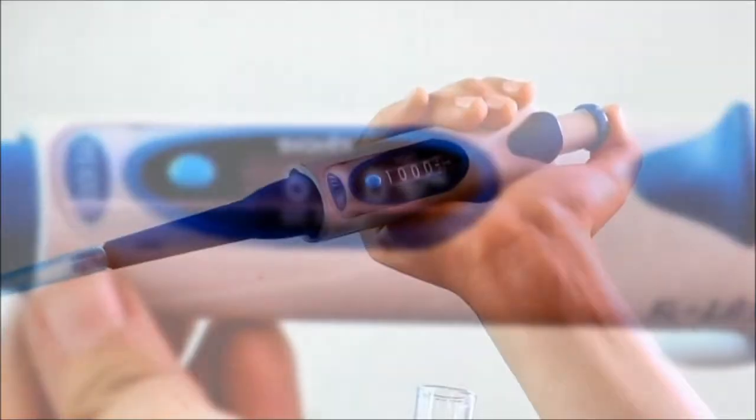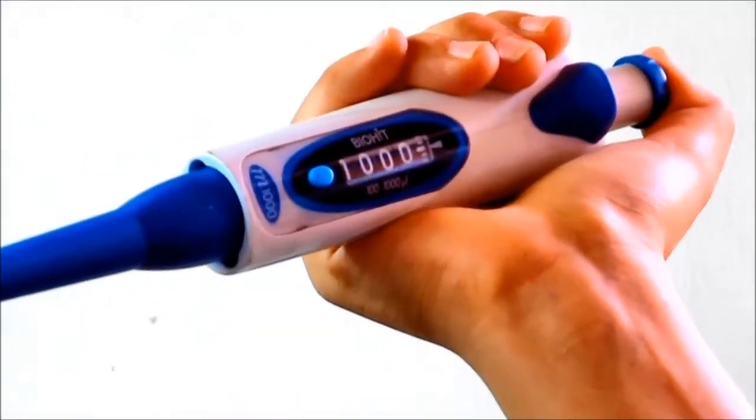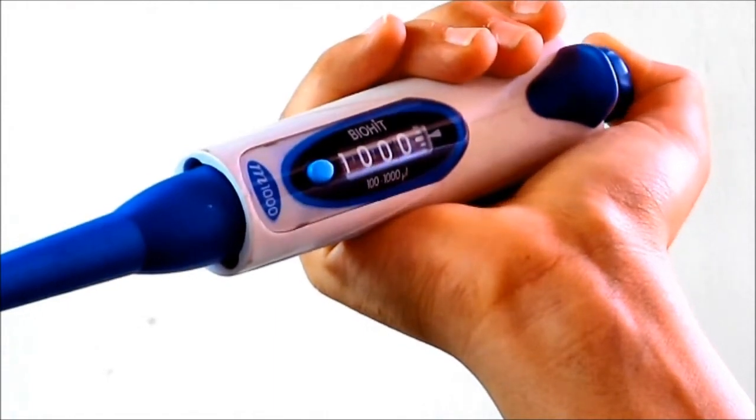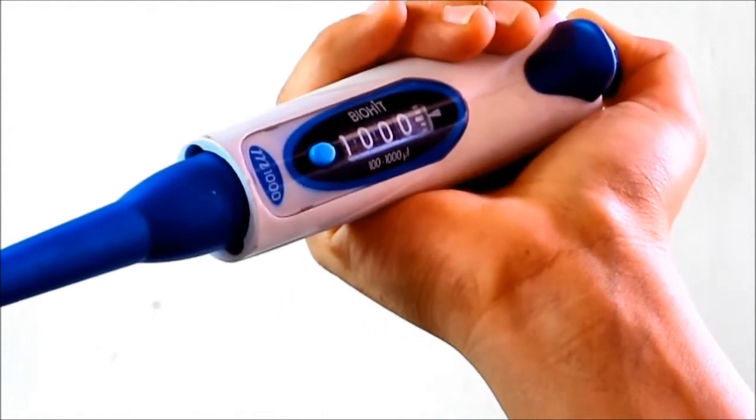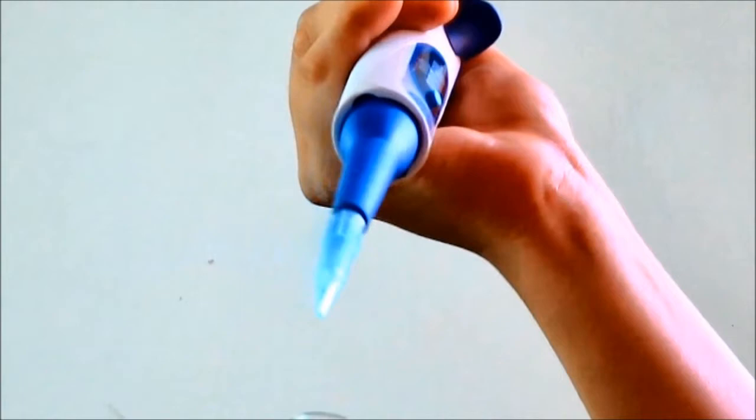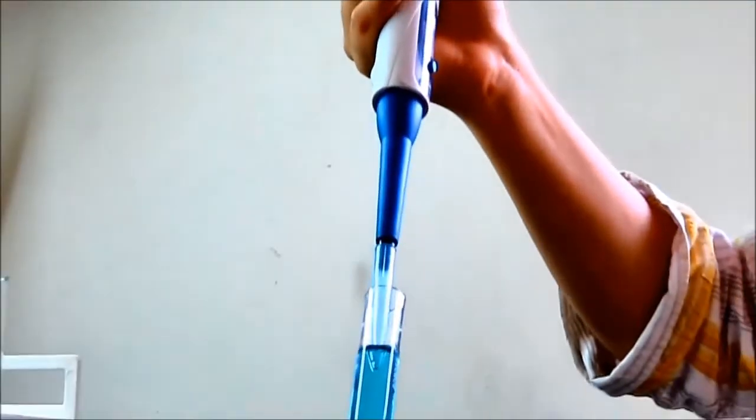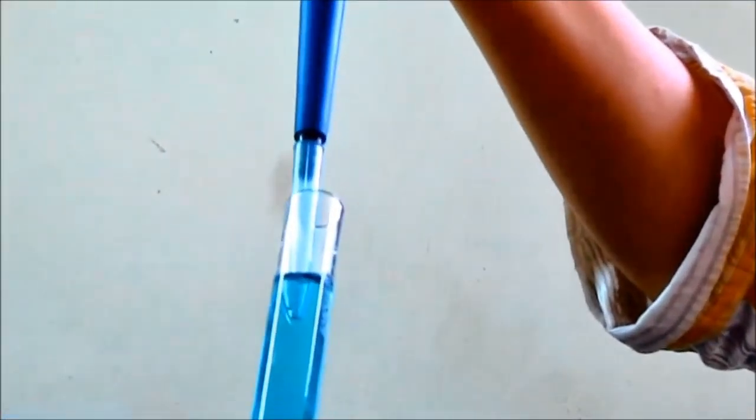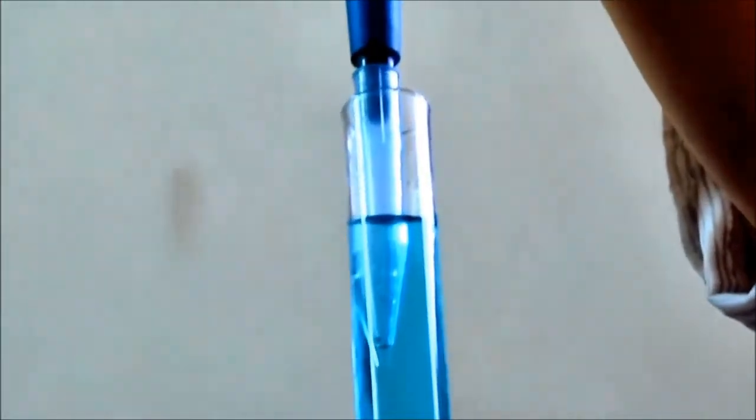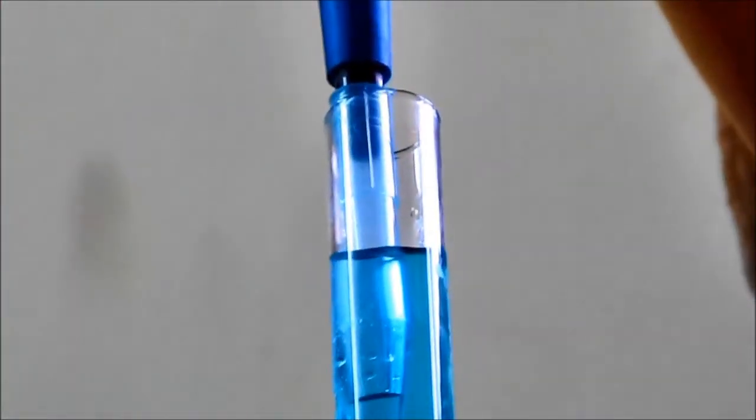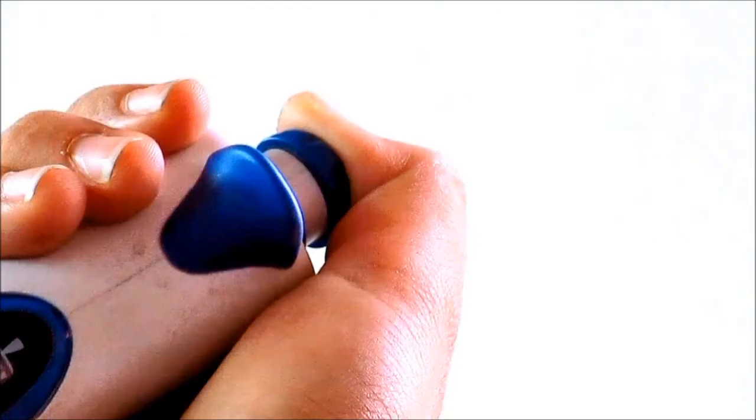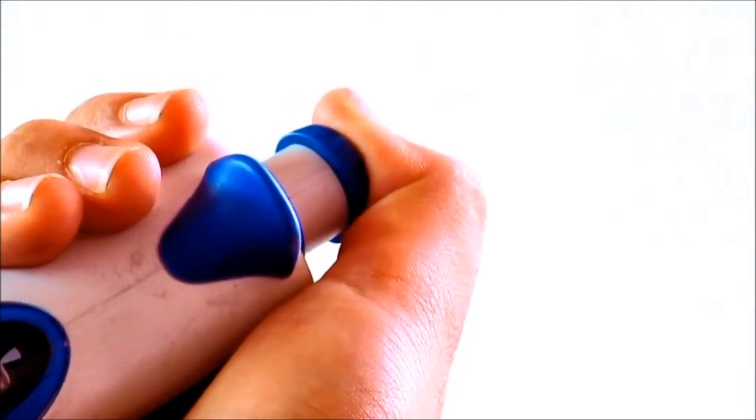The sample is drawn by pressing the volume adjustment knob, then putting the microtip into the sample and while releasing the volume adjustment knob, the sample is drawn into the microtip.